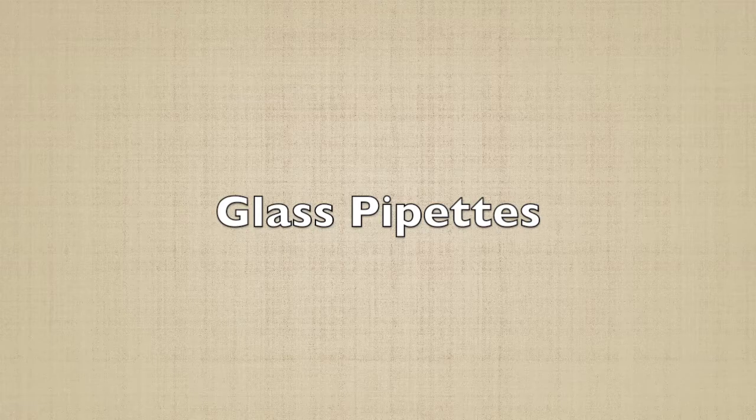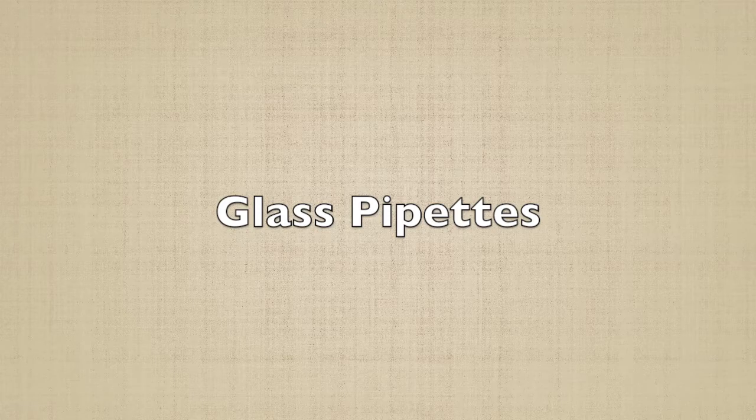In this video, we will introduce you to different types of glass pipettes and how to use them.